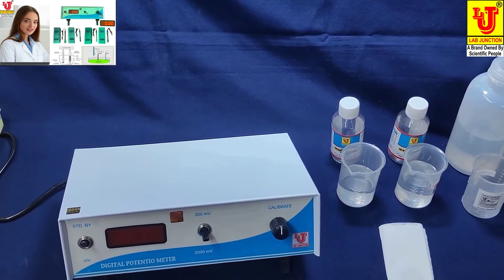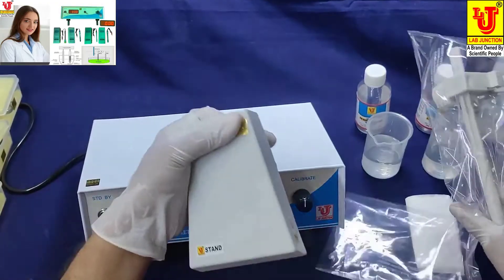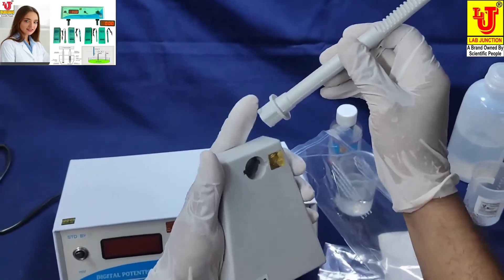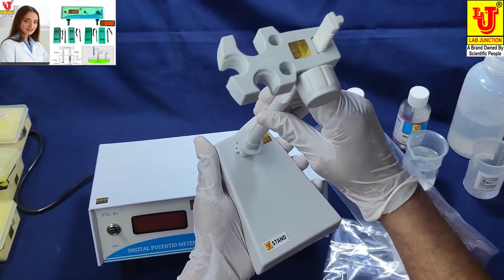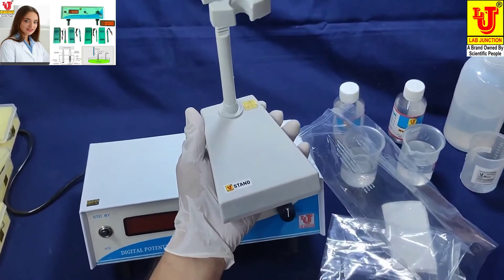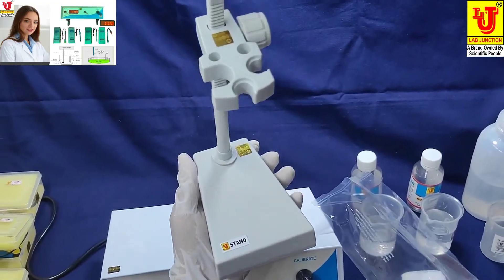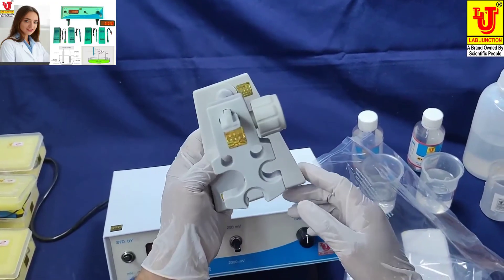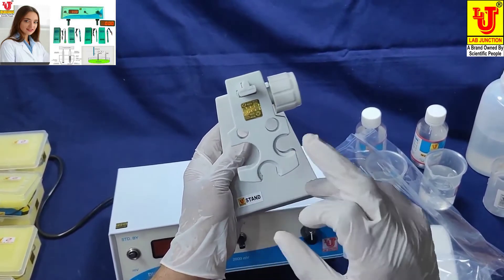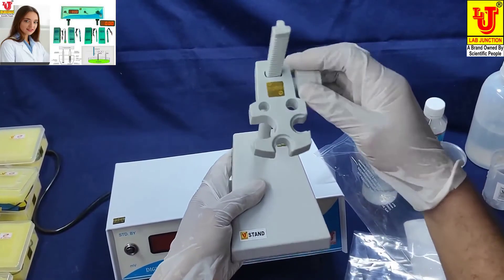This is the stand. You have to use it like this — these are the locks, you can insert them like this and move to lock it. Now the stand is ready. This is used for hanging your electrodes in the clamps. If you want to move it, you move it up or down.